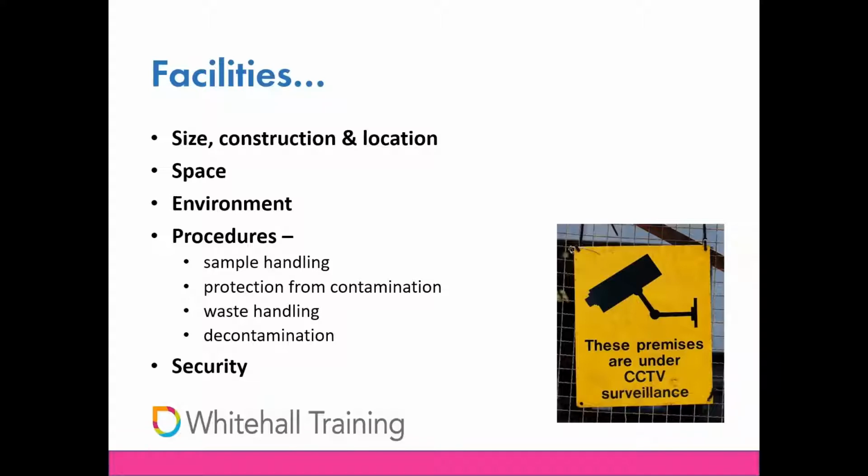So for those of you who attended the GDP webinar a couple of weeks back, you'll see there are quite a few parallels in GCLP, and for those who attended the GCP one, you'll also see there's some parallels there as well. The environmental conditions need to be appropriate for the work that's being performed to ensure that the data is going to be reliable. And it's important to ensure that the arrangements for sample handling are such that the sample integrity is maintained and cross-contamination isn't going to be an issue.